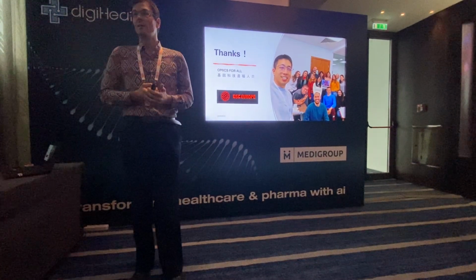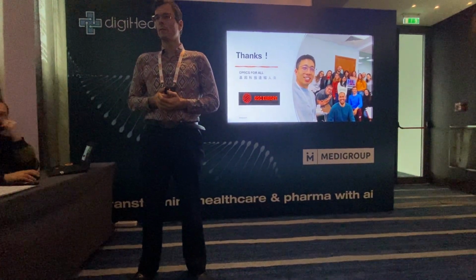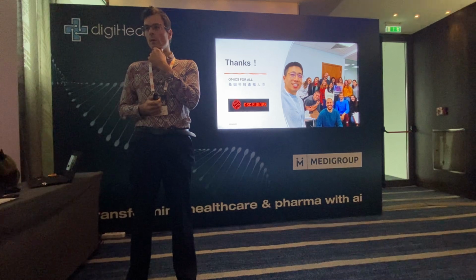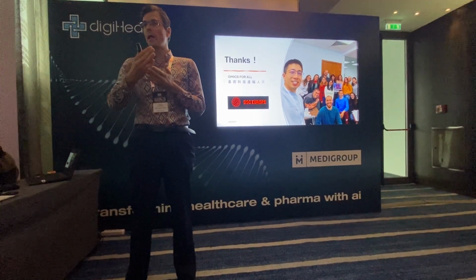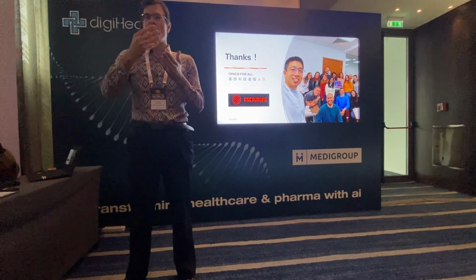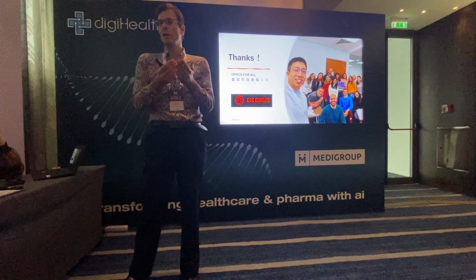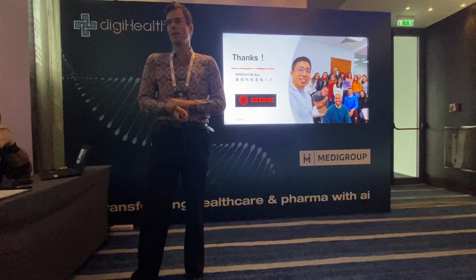Thank you for the presentation. I wanted to ask, what is the process to get those samples? For example, mouse kidney has this 3D structure, you showed that, so it has layers of cells. Do you have to slice it? Yeah, you slice it in a very thin way with some hard knives, and you can slice it literally to the size of a cell, like 10 micrometers, and you put that very thin slice on the chip, and you perform the process.